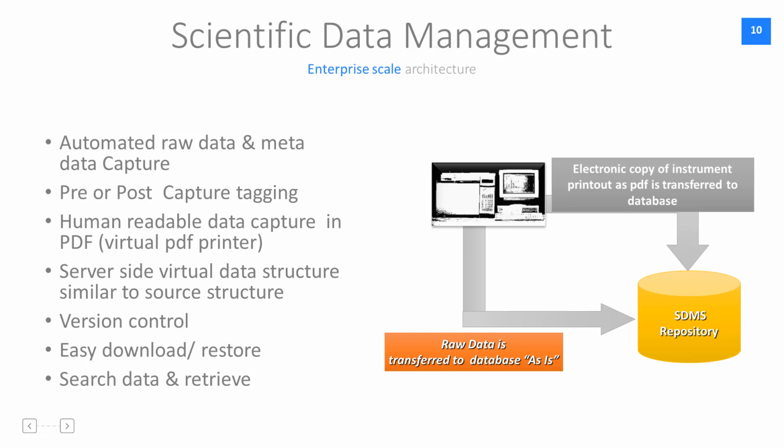The server side, as I was mentioning about the mimicking of folder structure, the system will be able to show you the virtual data structure at the server side. The system can do version control of data. Users will be able to easily download or restore their data, as well as search data and retrieve data at any point in time.